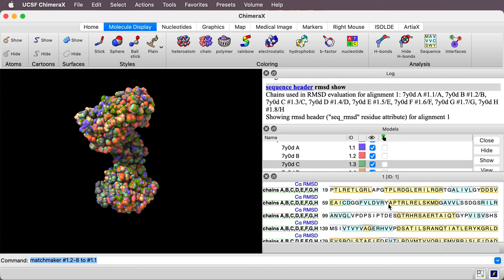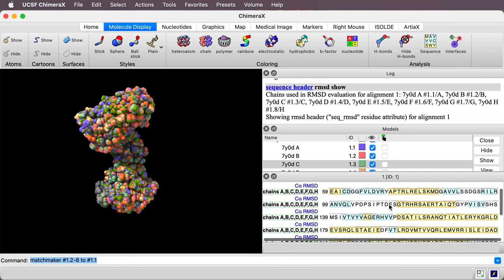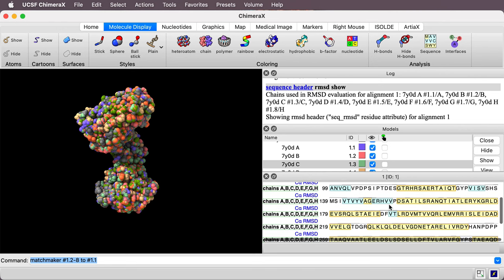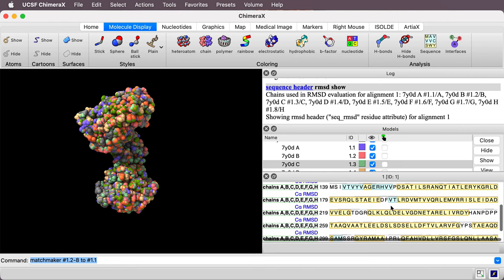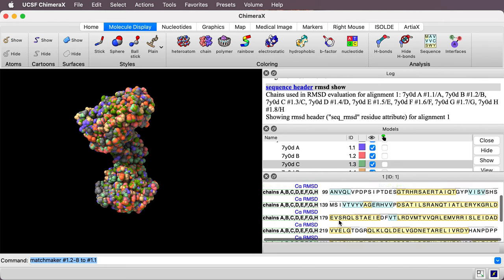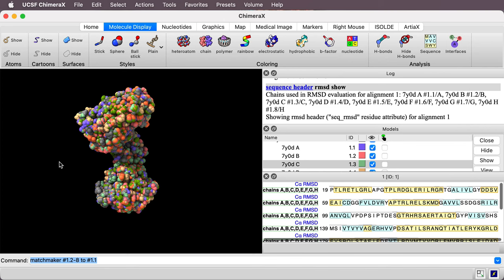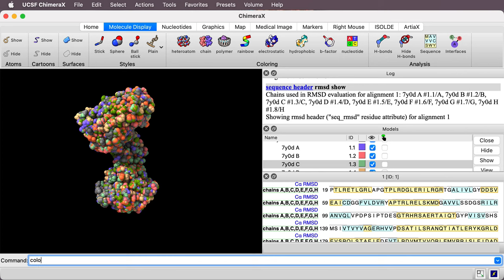Besides showing it in this window here on the sequence as a header, it's also assigned an attribute to the residues. And I can use that attribute to color. So let's do that.